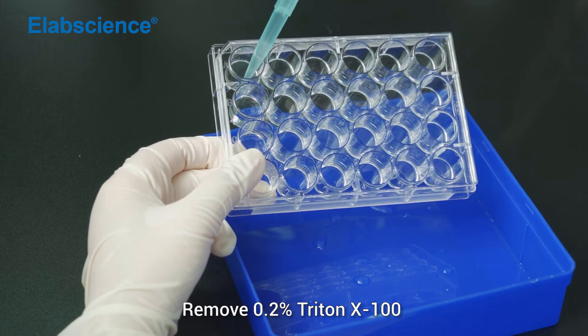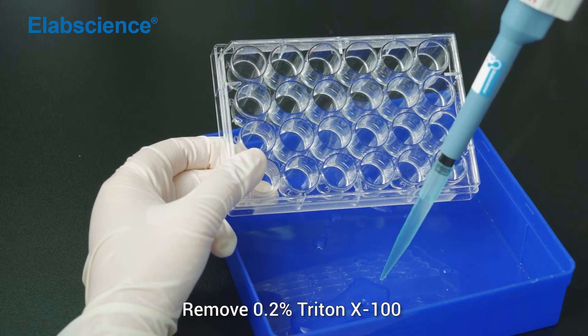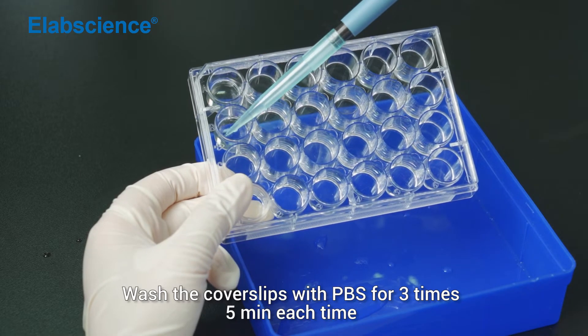Remove 0.2% Triton X-100. Wash the cover slip with PBS for 3 times, 5 minutes each time.